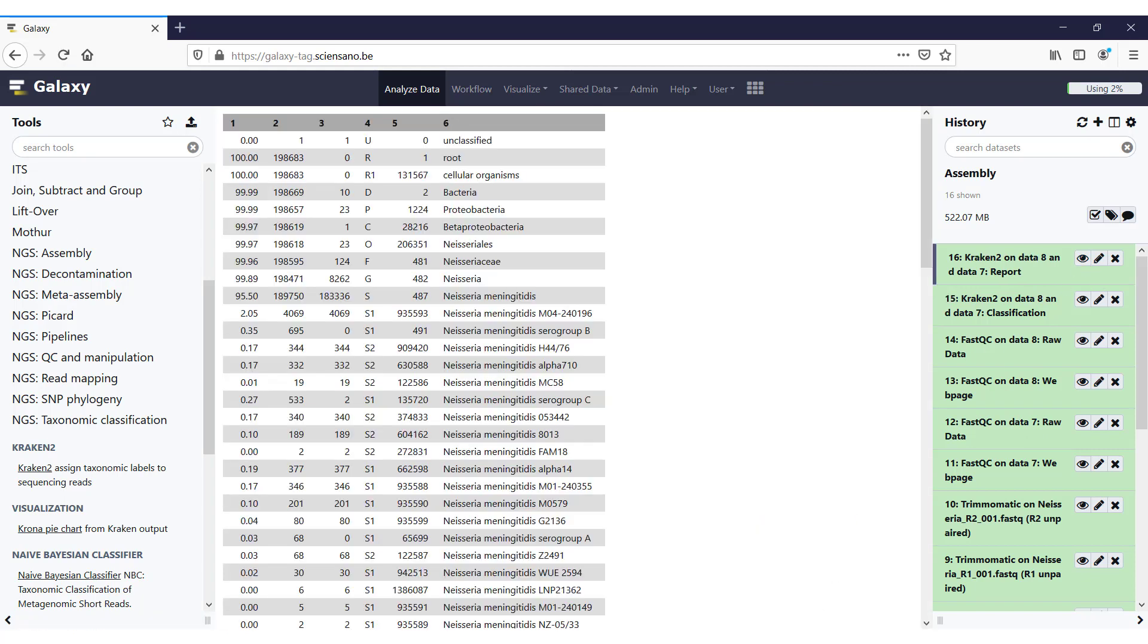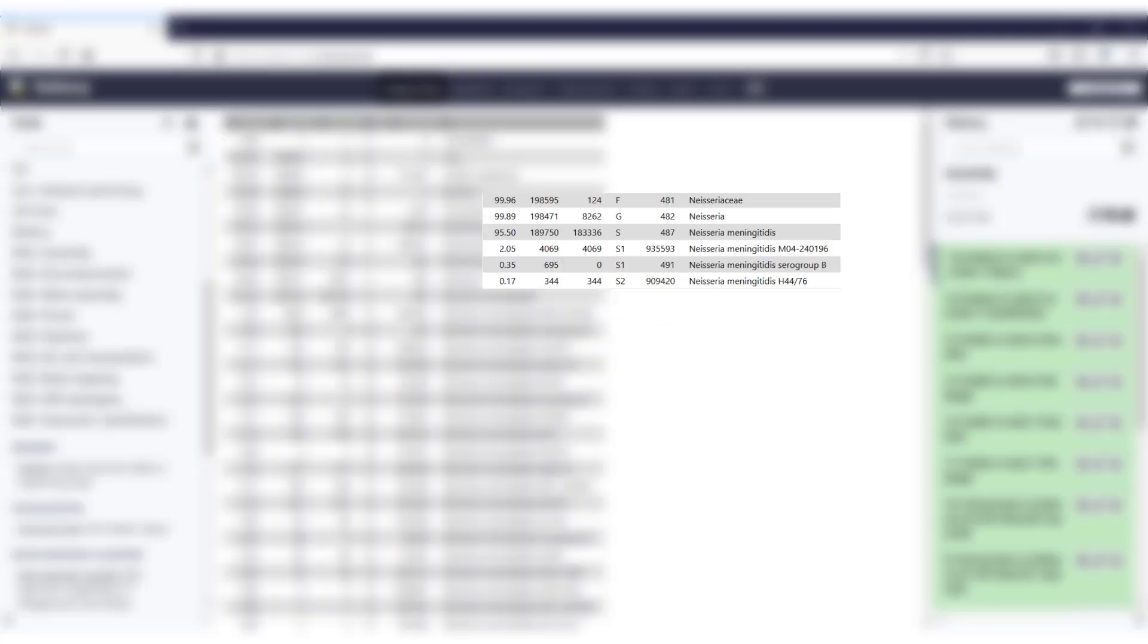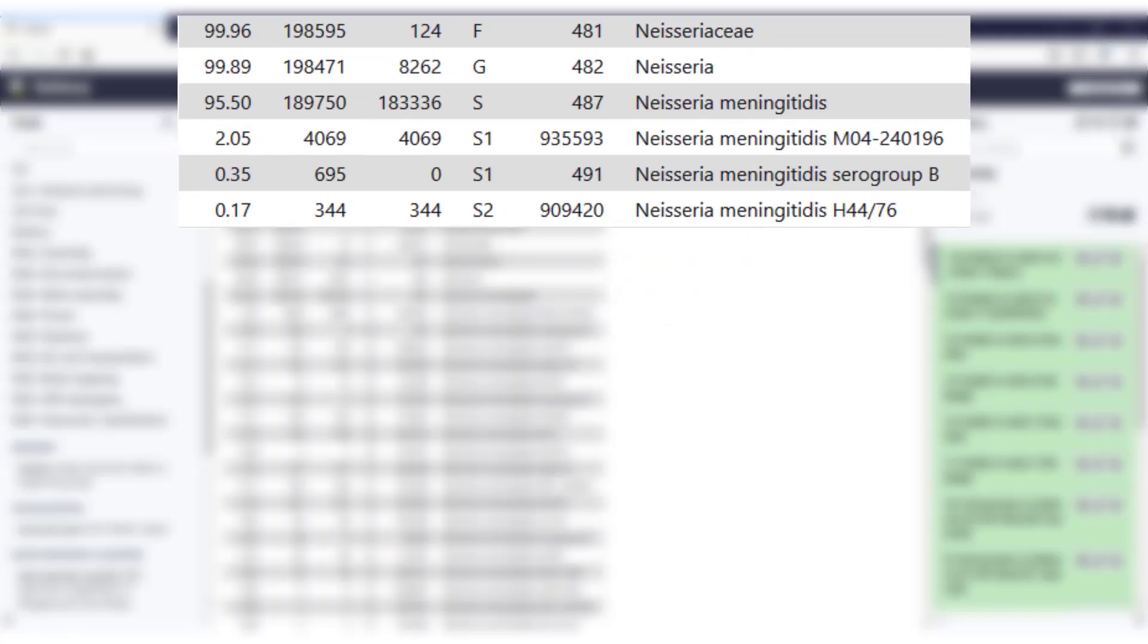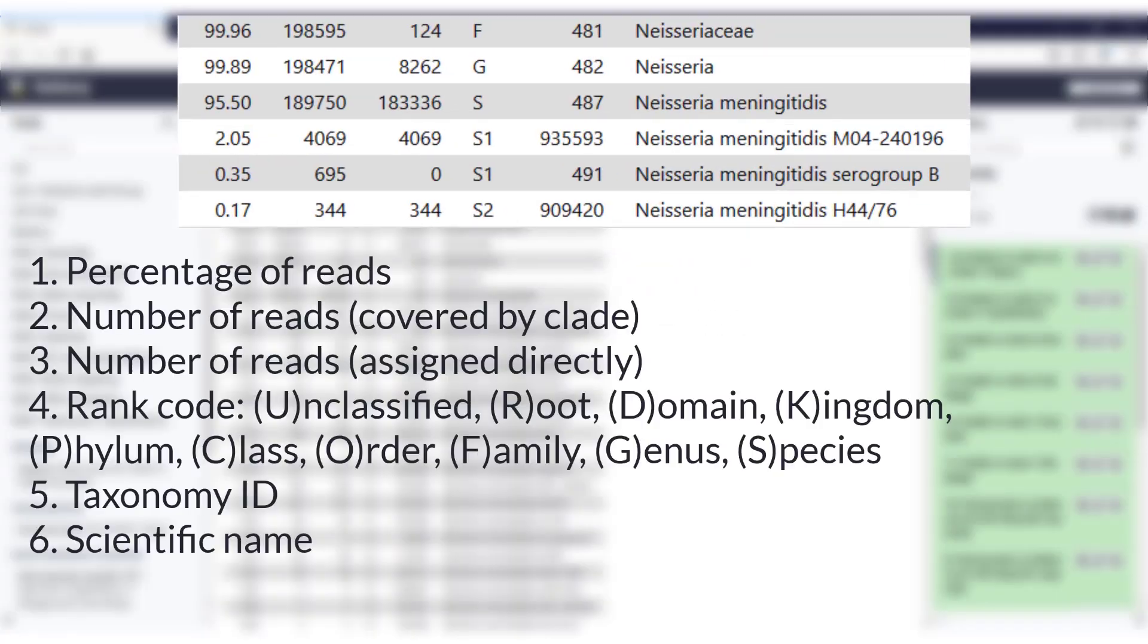So if we look at the report, we get a nice textualized overview of what was in the sample. This overview is in the form of a TSV file, so a tab-separated value file, and it has six columns. In the first column, we find the percentage of reads assigned to that taxon, and in the second column, the number of reads that were assigned to it. These numbers are cumulative, meaning that they contain reads from all lower ranks starting from that point. If you want to know how many reads were assigned to that taxon directly, you can find that number in the third column.